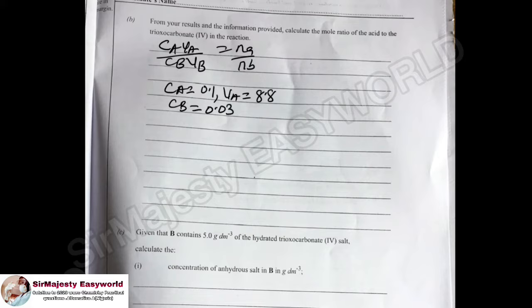Stick to the real concentration given to you in this question paper. In any exam, follow the instruction in the question paper. Don't mind what you read in the textbook. Follow what they are giving you. They are checking your solving patterns. Then my VB is 25. Your school might use 20, but here it is 25.